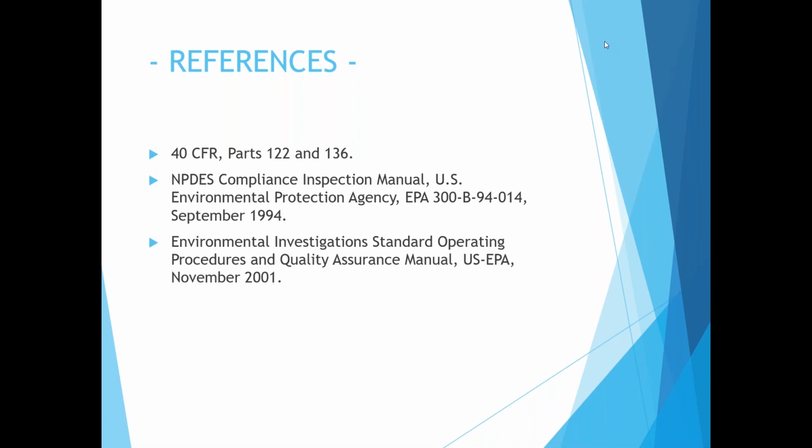And I know it's really difficult to do. But if you know how a pump works, it creates a vacuum. And so that vacuum is going to pull the volatiles out of solution. It's the opposite of what happens when you open a bottle of soda. So that's why you can't use any pump or any suction to sample a volatile. Thank you very much.